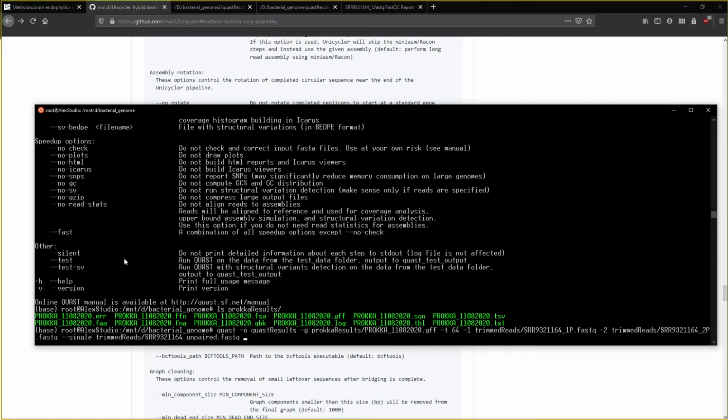Okay, we'll set our gene threshold to what Galaxy used. Gene thresholds 0, 1000. So you just put a comma between them, and then we'll give it the assembly. So the actual config file that we have, and that's assembly.fasta.